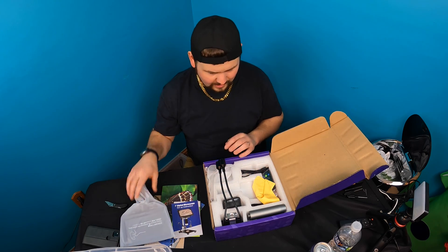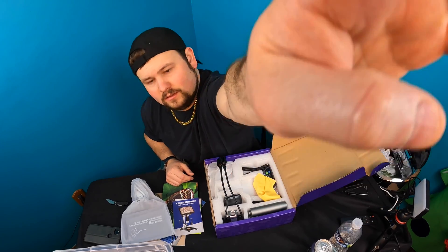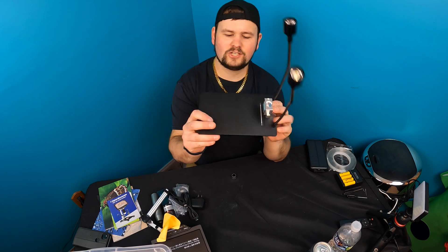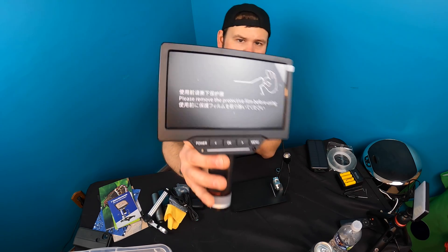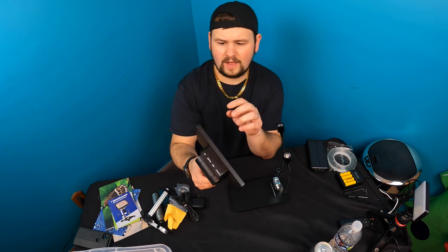Here's the screen — let's go ahead and unpack everything. Finally, a company that gives you a nice long base. I'm so tired of companies that cut the base off so short. This is a nice long base. This here is your actual monitor — the screen you're going to use.